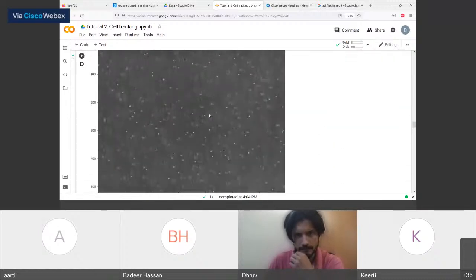Now, what you see is that their appearance is somewhat like blobs. Similar to cells, they appear as a smooth intensity region surrounded by a background, and there are many different objects over here. Now, this data set is quite tricky to segment these granules out specifically, because there are many other background things over here.